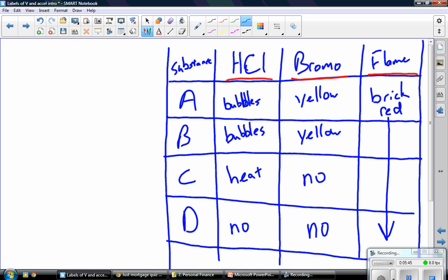I would say similar, a strong possibility that they're the same, but I wouldn't go so far as to say they are 100% the same. I could likely give you several different substances that would react exactly the same way to hydrochloric acid and to a flame test, and come out with similar results. Okay, but they would for sure or almost definitely have similar properties.